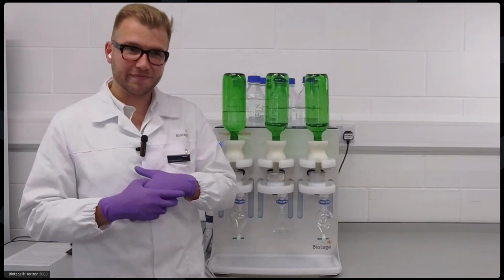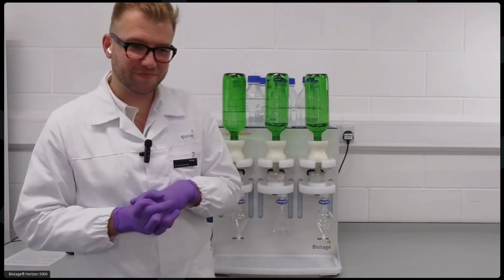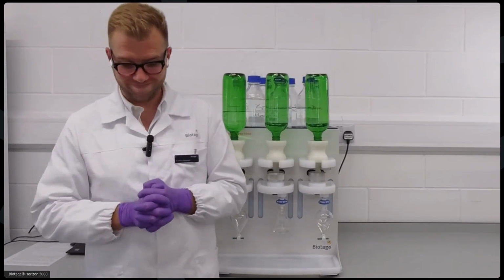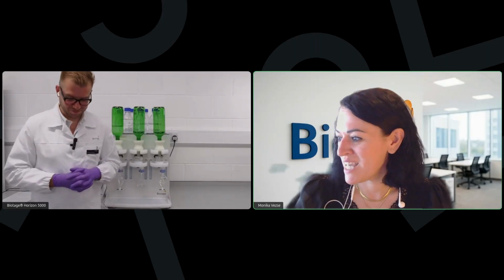So we have many other questions. Should we take a few more? Sure, yeah, okay, all right. So there is a long list. I'm going to try and pick the most relevant ones here. Those questions we are not answering right away, we'll get back to you via email.